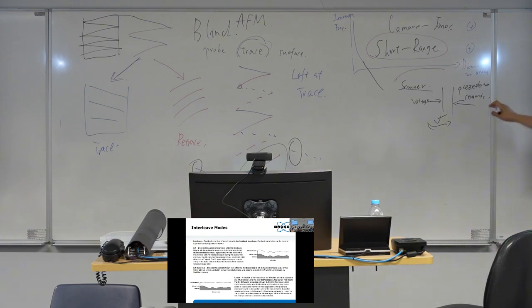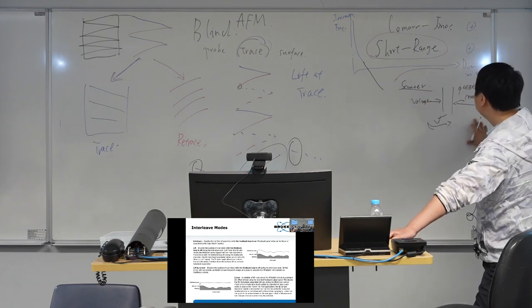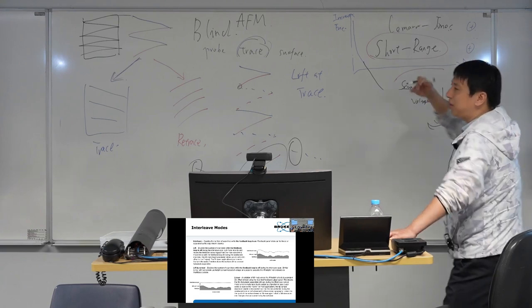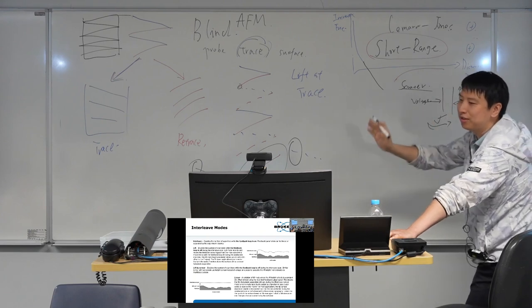That's the piezoelectric effect. And we will go through that tomorrow. So that's our scanner. So how we control the probe is moving on the surface.